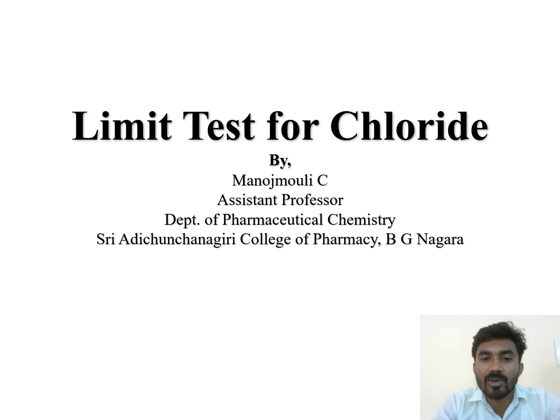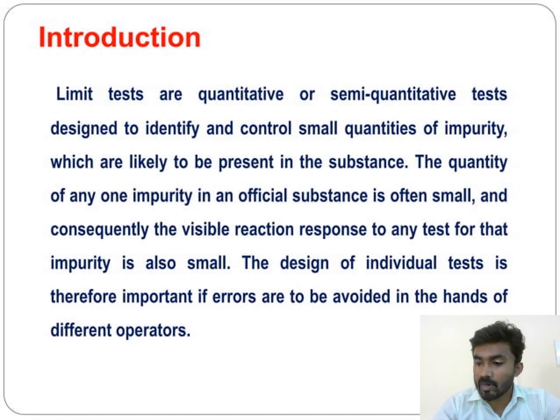Today I am going to discuss the limit test for chloride. Before we discuss the limit test for chloride, first we are going to know what a limit test is.